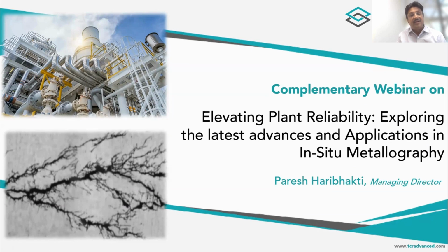I'm going to talk on a very interesting technique: elevating plant reliability, exploring the latest advances and applications in in-situ metallography. We all know that in today's time, there are a lot of pressures on industry to ensure that the reliability of the component increases, and also there is a pressure on industry for plant life extension.